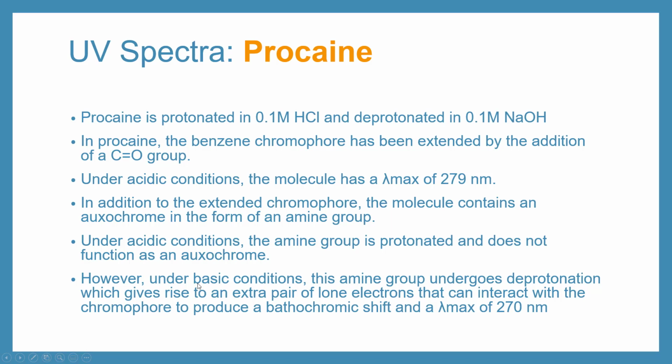So this is a recap from what I've just said. Under those basic conditions in that sodium hydroxide, that amine group is becoming deprotonated. We gain access to those lone pairs of electrons. They can interact with that chromophore to produce a bathochromic shift and a lambda max of 270. So just be aware, it's very, very important. And again, it is something we'll see with our methyl orange experiment next week, that the solvent that we use, the pH of the solvent, does have an effect on our lambda max, does have an effect on our absorbance intensity.